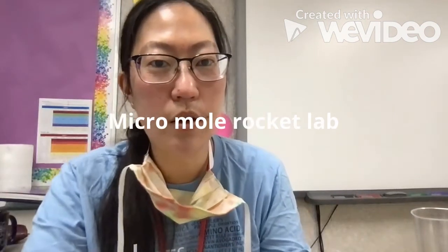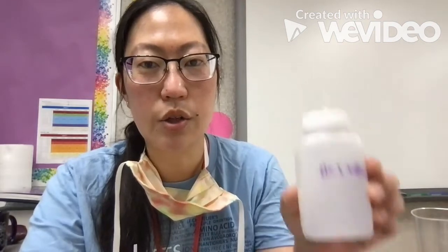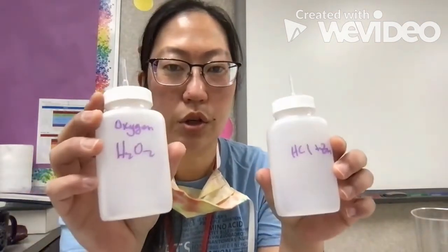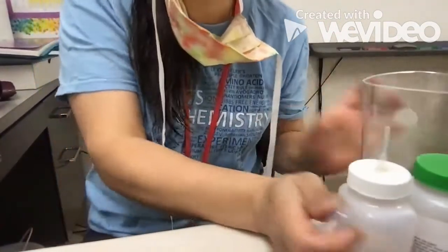Hi students, today you're going to be doing the micromole rocket lab, and so I'm going to show you how to make your hydrogen generator and your oxygen generator and fill your rocket. So the first thing is just to practice how to fill the little rockets. Put this to the side.